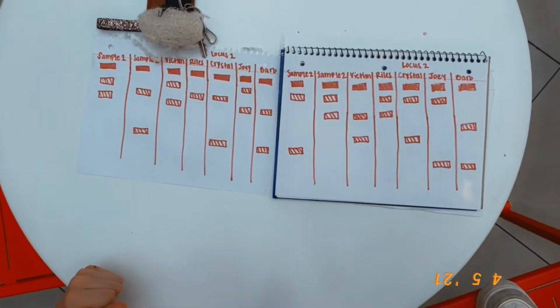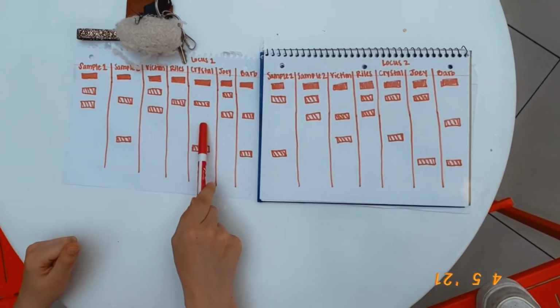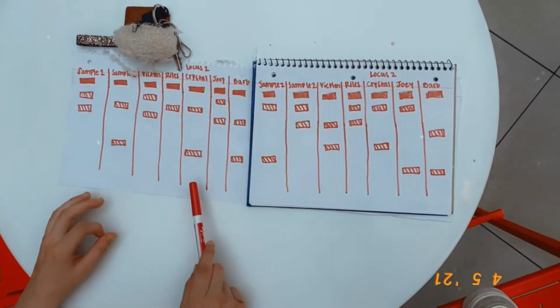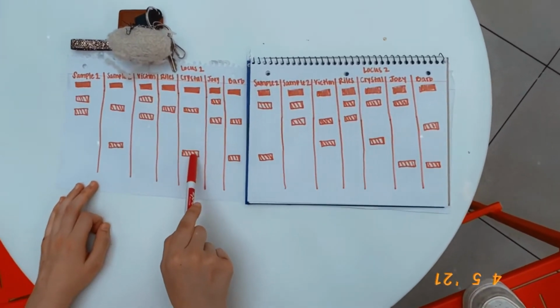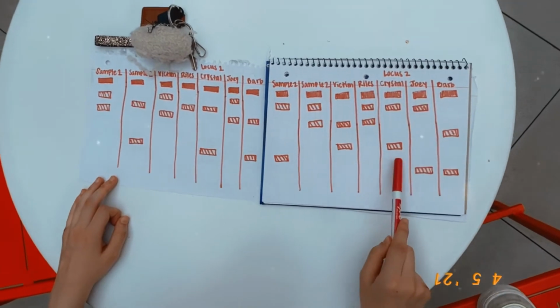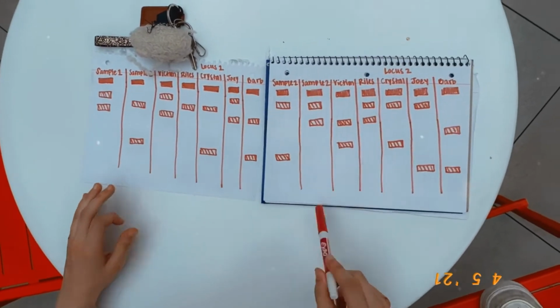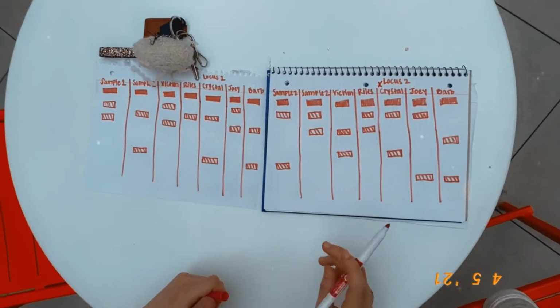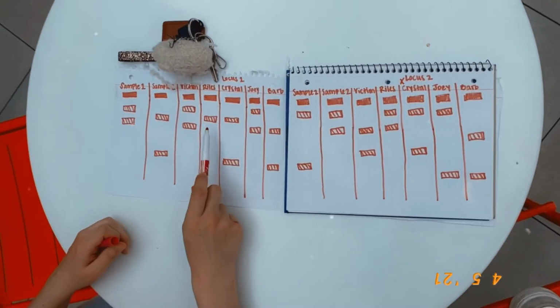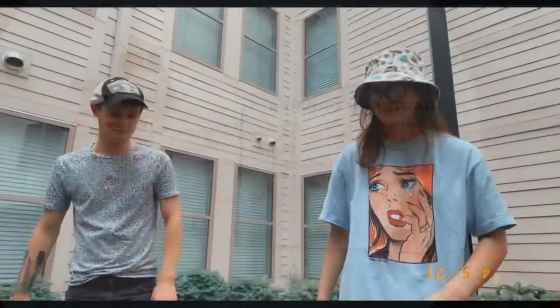Now we can look and see if Riles and Crystal are guilty. So we can see on sample 1 that neither Riles or Crystal have matching bands, which means they can be ruled out for hair sample 1 on locus 1. However, we can see that Crystal has matching DNA bandwidth with hair sample 2 on locus 1, so we need to check locus 2, and we can see that Crystal does not have matching bands for sample 2 on locus 2, which means Crystal can be ruled out as a suspect. Riles has matching bands on locus 2 with sample 2, but if we go back to locus 1, she does not have matching bands with the sample 2 on locus 1, which means she is also ruled out as a suspect.